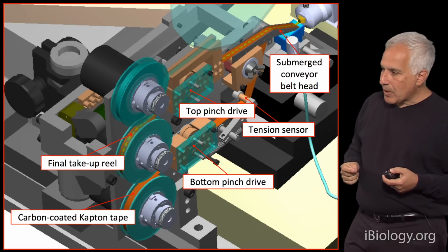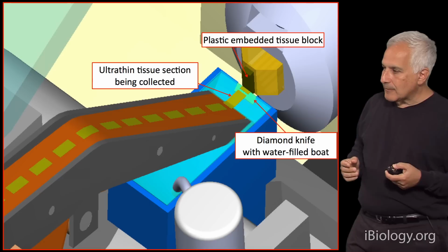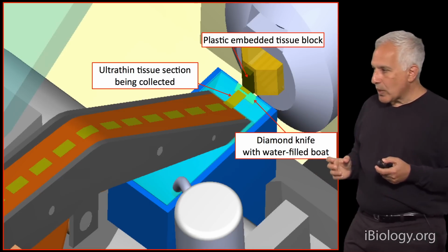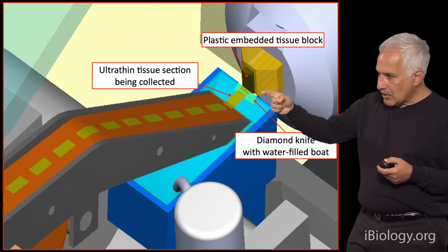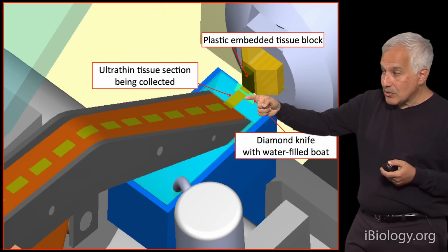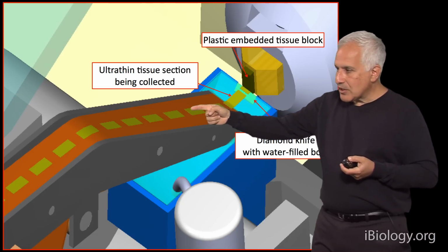And let me just zoom up on the guts of this, the important part, which is the collection part right up there. So here is a block of brain where the brain has been embedded in a very hard resin. And then a microtome is moving that piece of plasticized brain up and down against a diamond knife. And the diamond knife peels off a section that's about 30 nanometers thick, or often thinner than 30 nanometers, which floats on water and then is picked up by this conveyor belt.